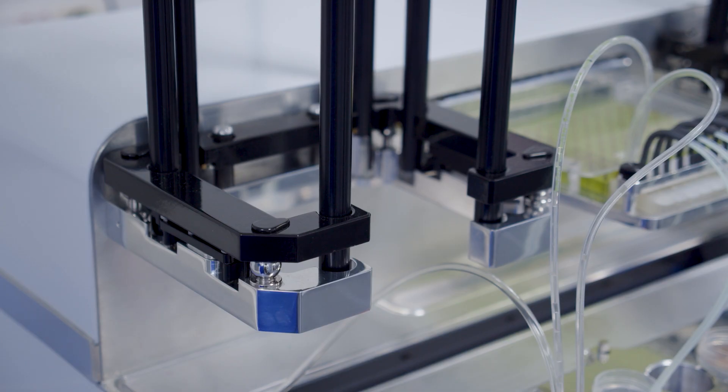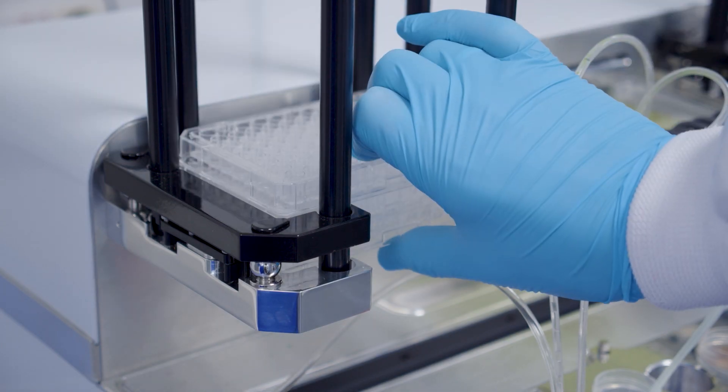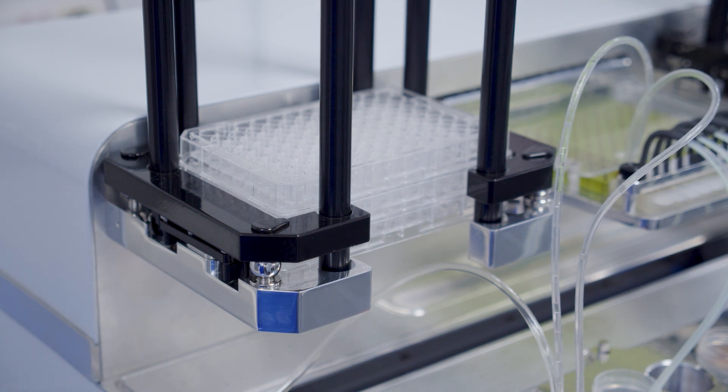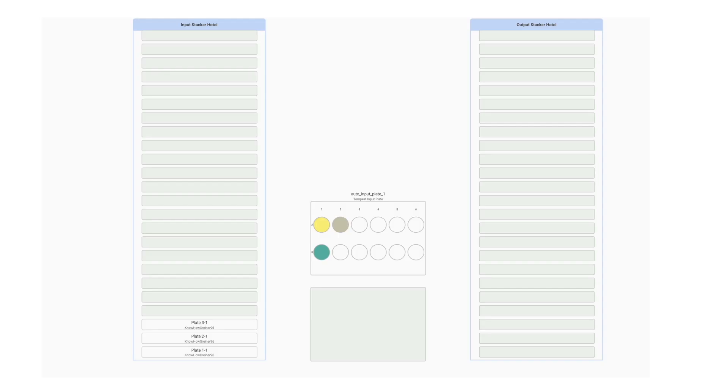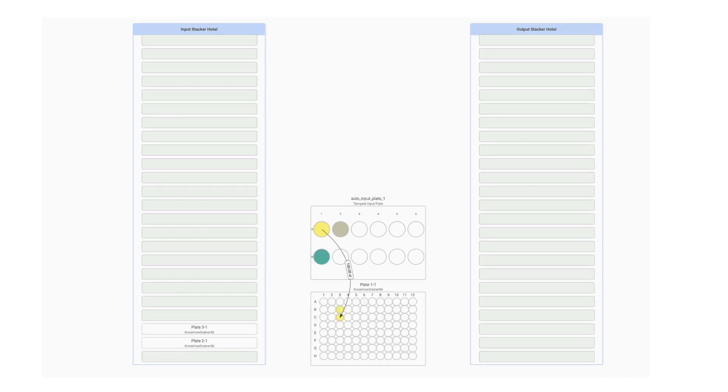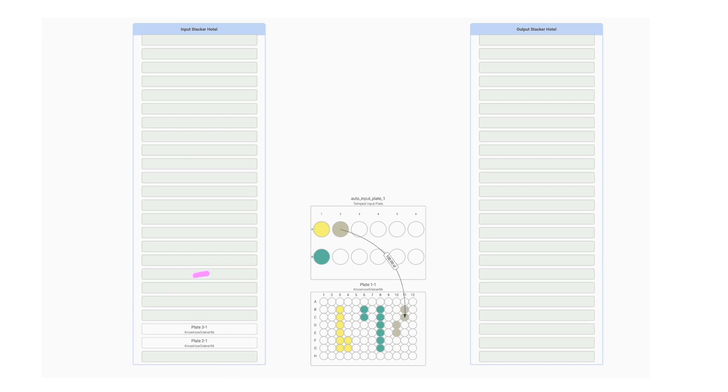Then load your plate or plates onto the stacker. If you're using different plate types, you'll need to ensure they're in the correct order, so you can refer back to the preview tab on Synthase to make sure they are.